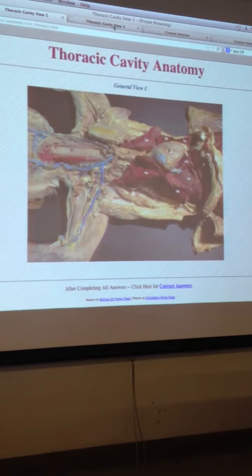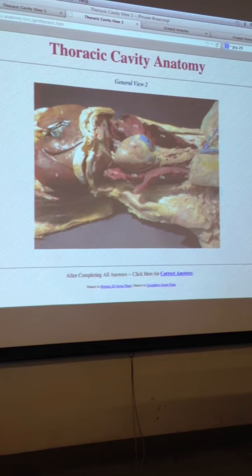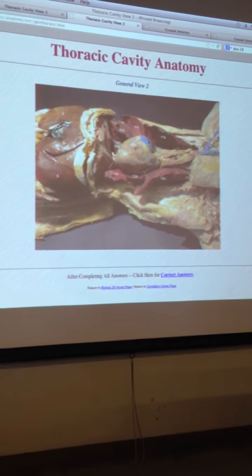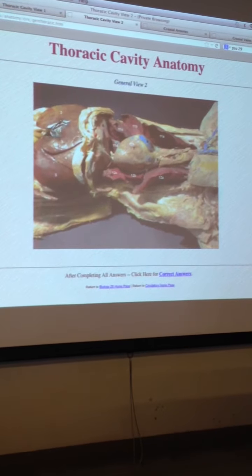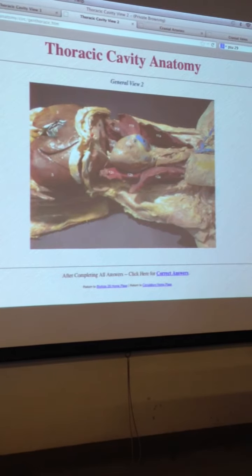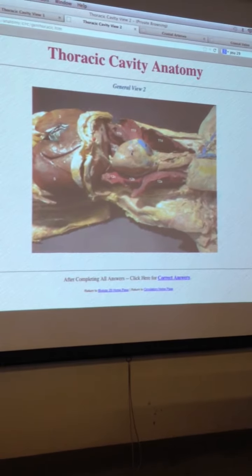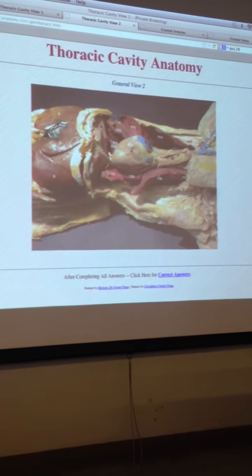Now I'm going to switch views again. The cat actually flips directions, so here's the diaphragm, the abdominal cavity, the head would be over here. So right here where it has that 9 and this little membrane chunk right here, that's the parietal pericardium removed. And then here we just have the surface of the heart showing. And that surface of the heart, if it was pinned and we were asking you to identify the layer, we would be asking for the visceral pericardium.